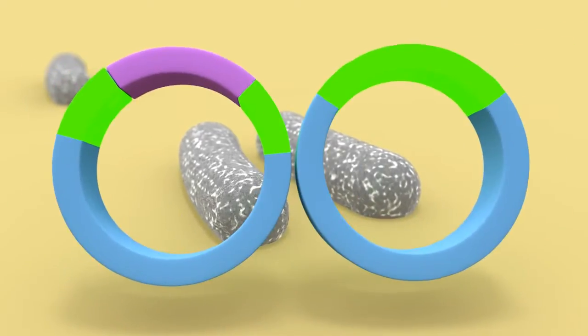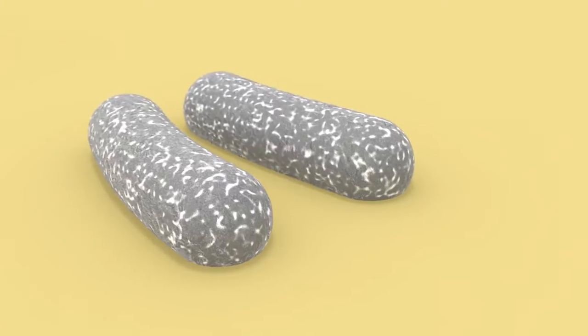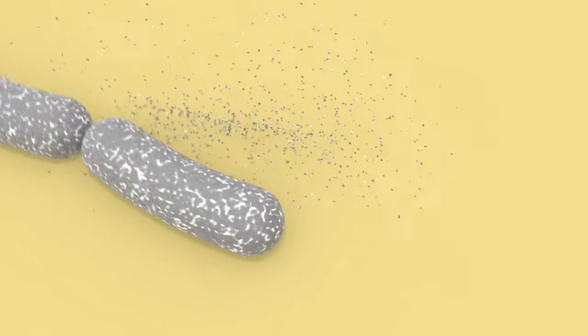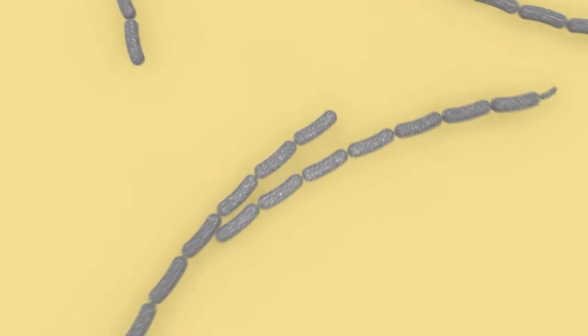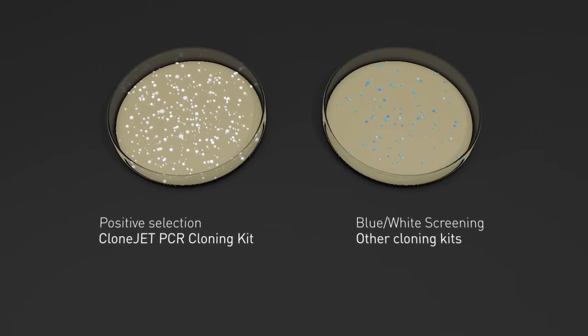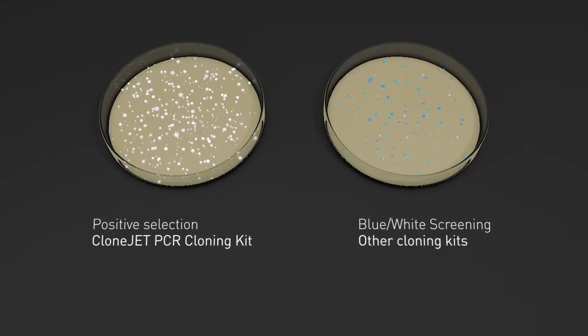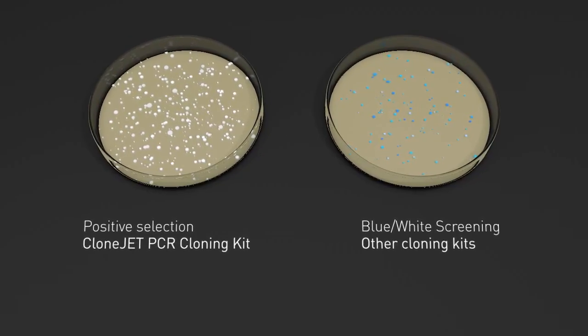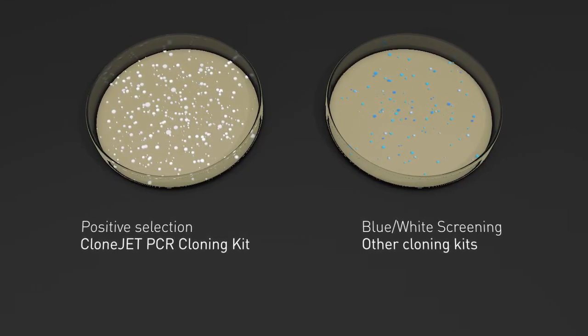As a result, when the ligation products are transformed into E. coli, only the cells with the recombinant plasmid will appear on culture plates. Cells without DNA inserts express the lethal gene, causing cell death. This approach eliminates the need for expensive and hard to decipher blue-white screening required in other cloning systems.